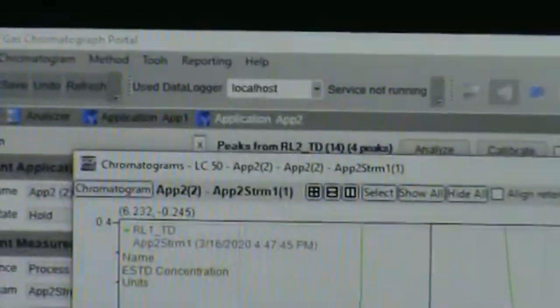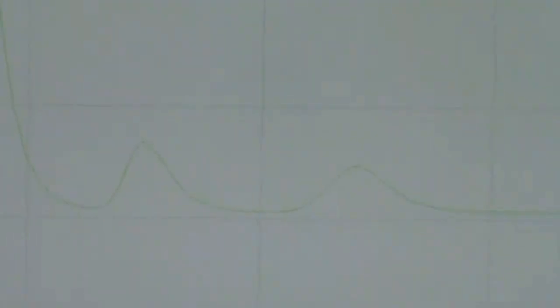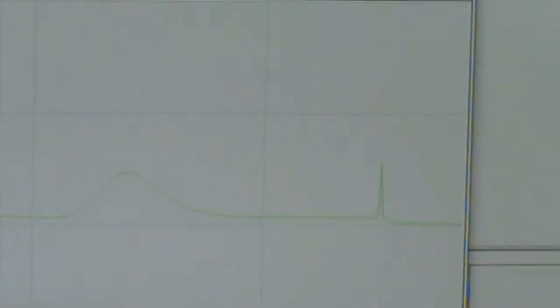Carrier gas will pull everybody through the sample loop and push them across detector number 1, RL1. We need to see our nitrogen, we need to see our super lights come across there. And after we see them, there's our ethane. Once we see our ethane, then we shut the door and start back flushing everybody heavier than a C2. That is our C2. So that shows me that we got everything and everybody that we want on this side for our super lights. So we will kill this.